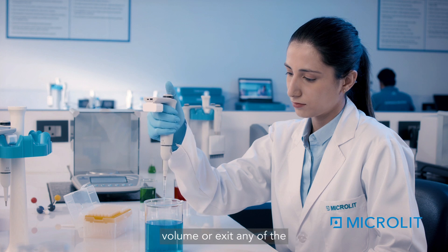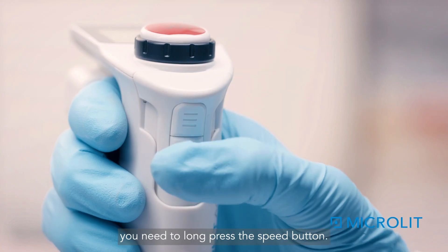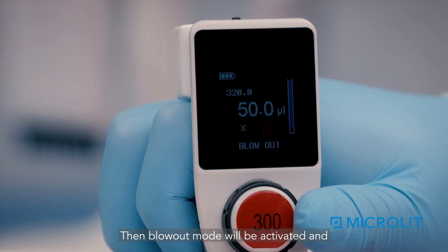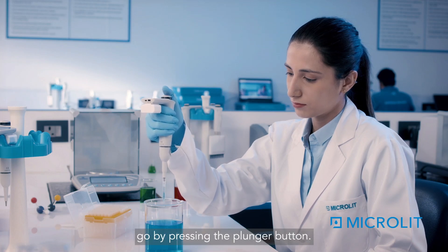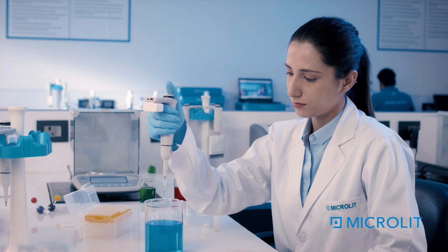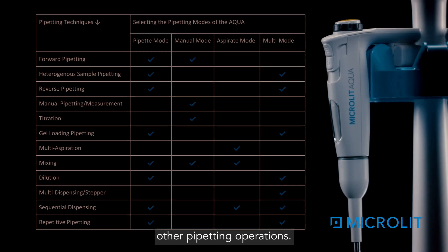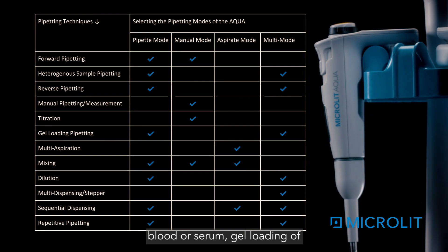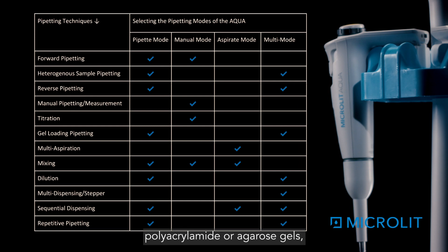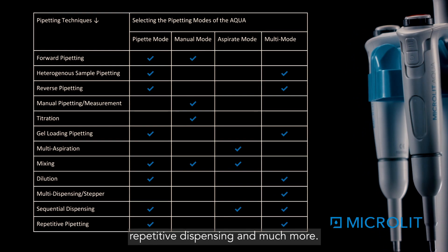To dispense controlled volume or exit any pipetting mode after aspirating, long-press the speed button — blowout mode will be activated and you can dispense the residual liquid in one go by pressing the plunger button. While using the four main pipetting modes, you can also perform 12 other pipetting operations such as heterogeneous sample pipetting of blood or serum, gel loading of polyacrylamide or agarose gels, sample dilution, sequential dispensing, repetitive dispensing, and much more.